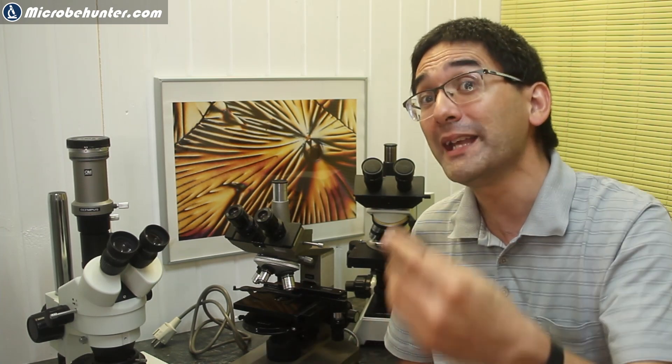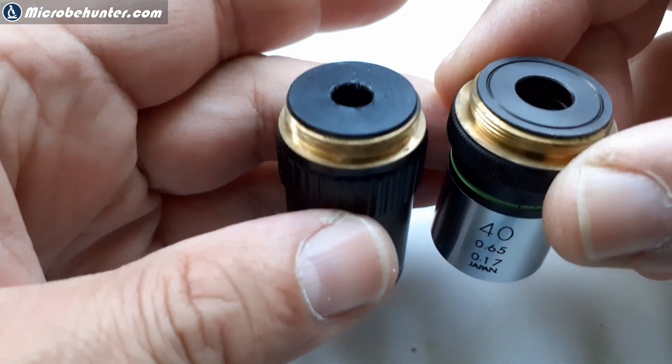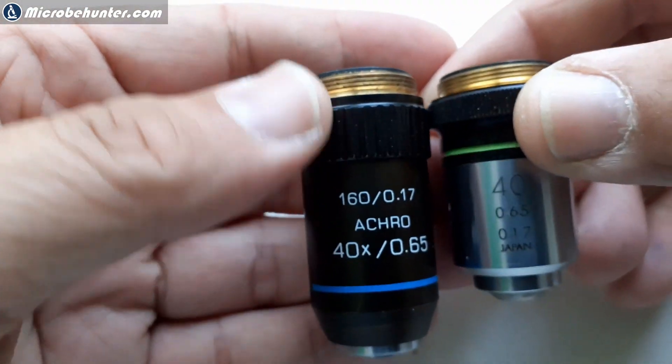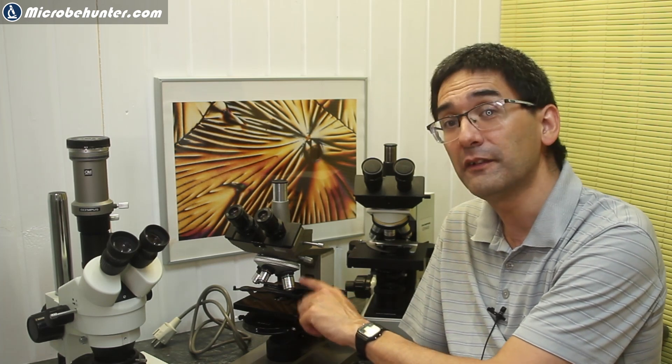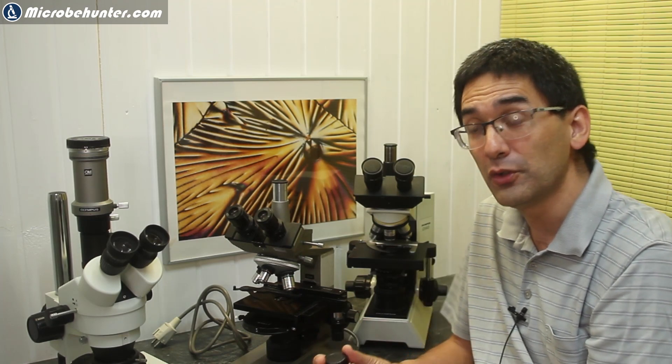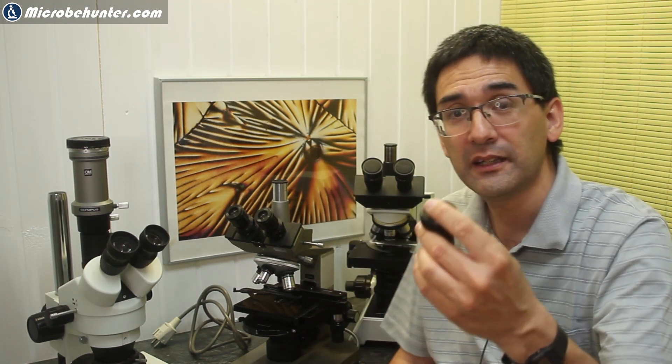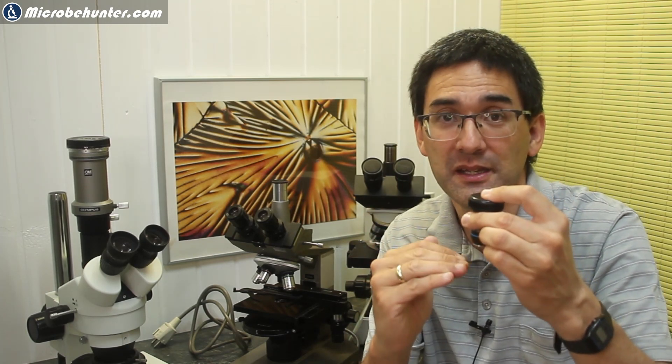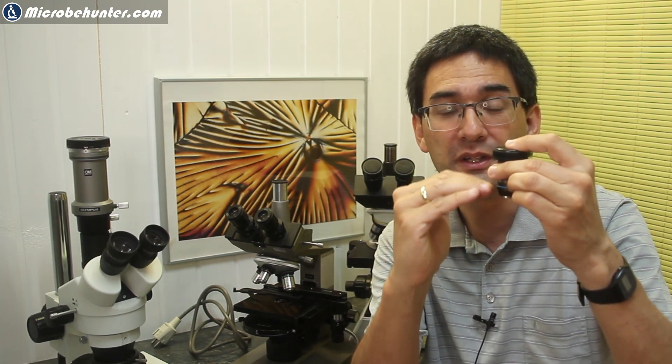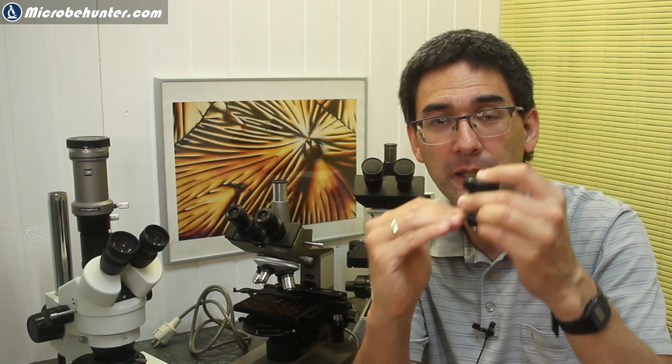If you want to exchange the objectives now, there's a problem, or there might be a problem. Even though you can exchange it physically, the threading is the same, you have to be careful that there is indeed enough space between the stage and the revolving nosepiece. This means you have to be able to lower the stage sufficiently that the large objective also still has space. If you're not able to lower the stage all the way, then you're not able to mount the objective.